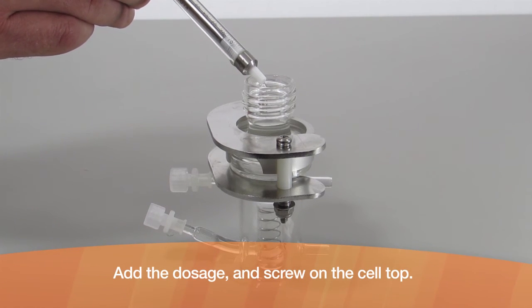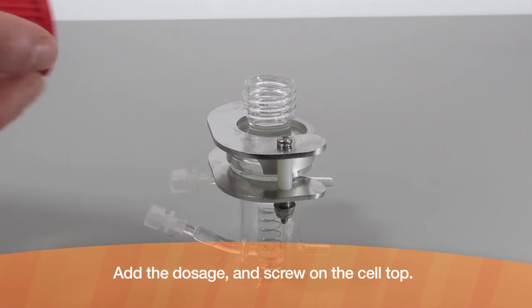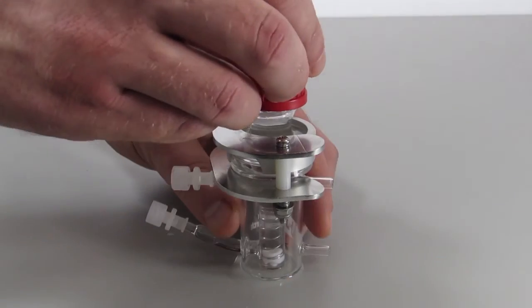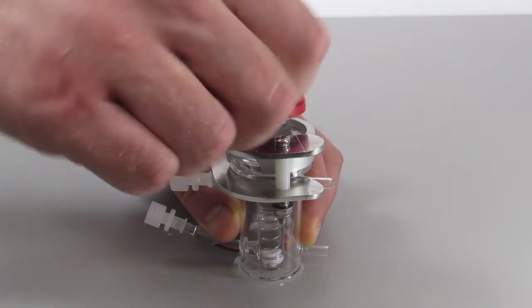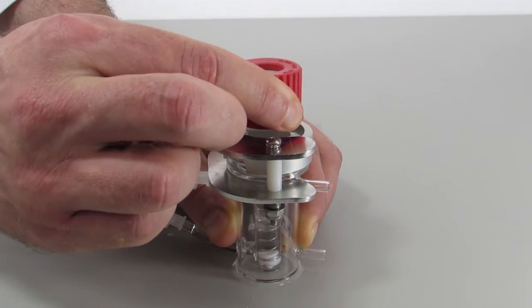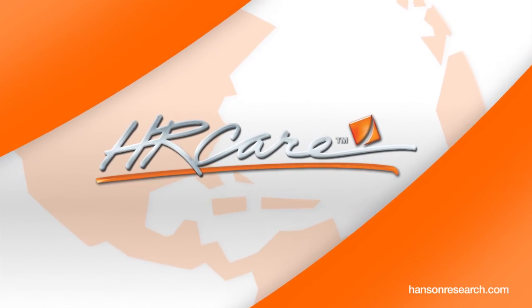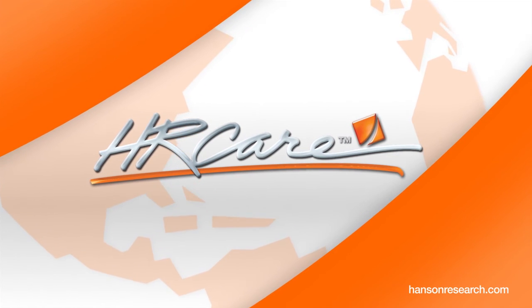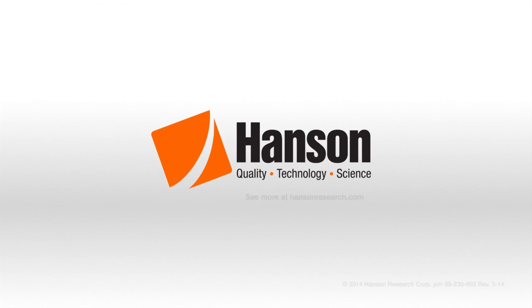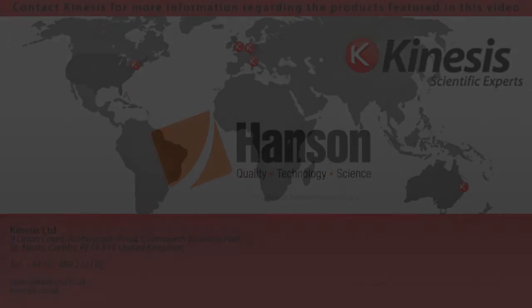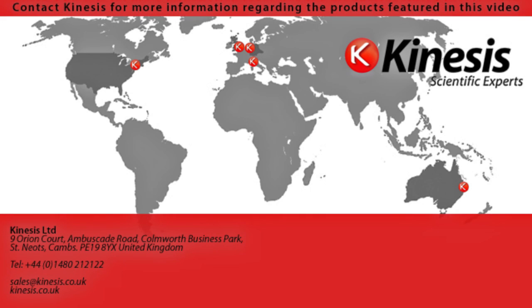Add the dosage and screw on the cell top.